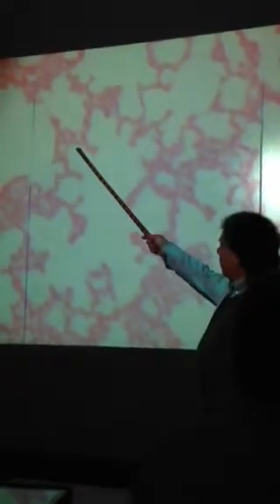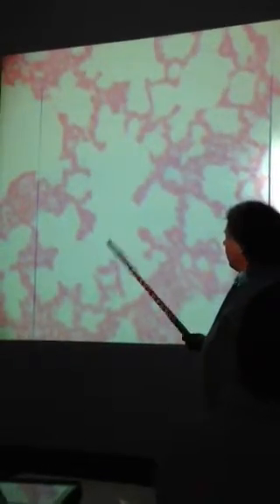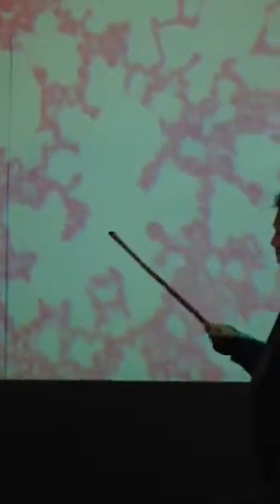These are little outpocketings. These are alveoli, right? But if you look, you kind of see a pathway coming this way, a pathway coming this way, this way. So this is a common chamber leading into several little areas. So that could possibly either be an alveolar duct or an atrium. I take either one. You're not clearly into an alveolar sac. This looks like it could be an alveolar sac. This one has 1, 2, 3, possibly some more over here. So any of the common area out here would be either atrium or alveolar duct. Anything that's got 1, 2, 3 or more little humps, that would be an alveolar sac. Each little one of these would be a what? Alveolus, right? But this is lung tissue.